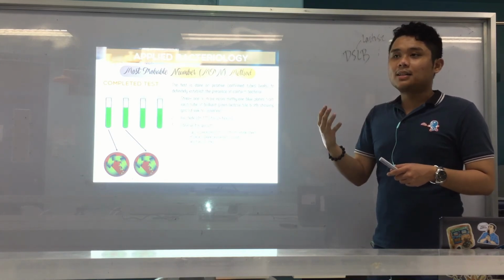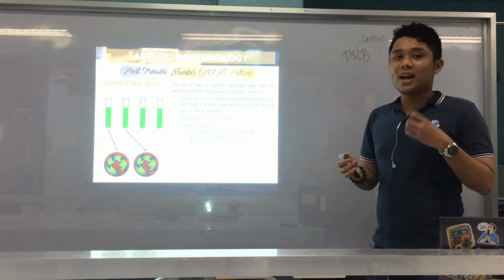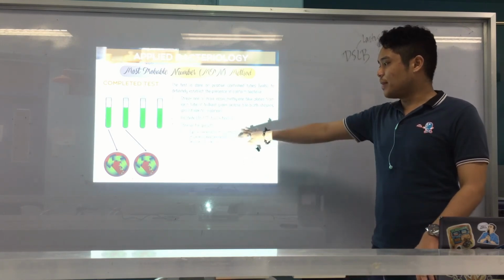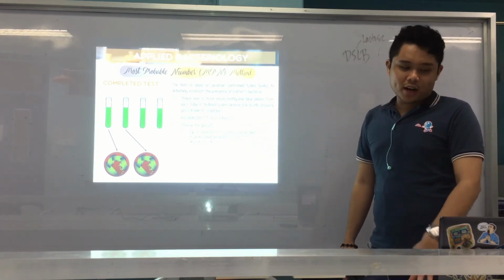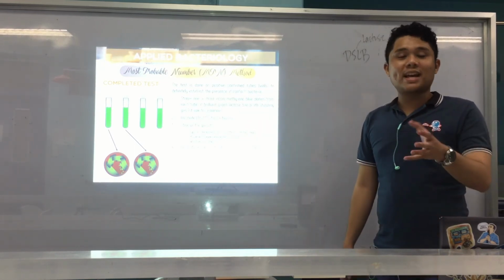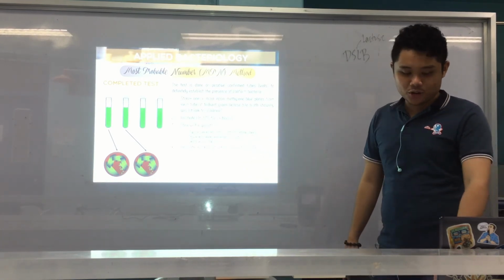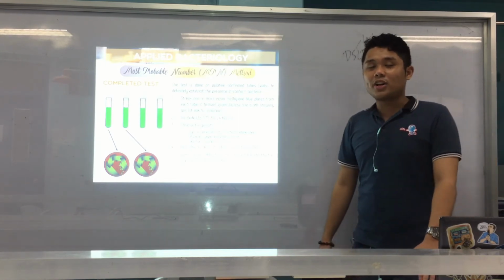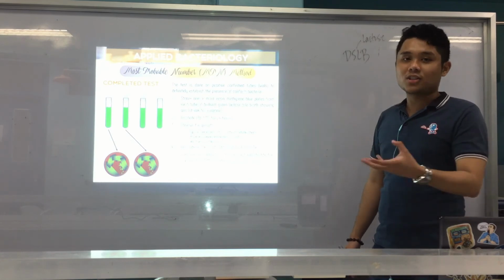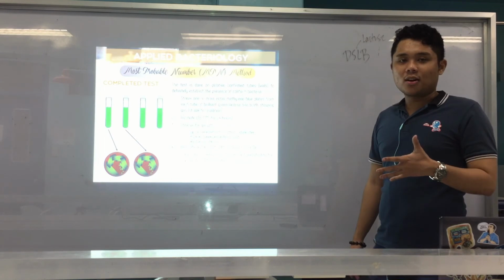Same as the colonies of your E. coli on EMB and also your Enterobacter. Enterobacter, fish eye colonies on your EMB. Okay? Alright, so typical, atypical, or negative if different colonial morphology. Okay, and from there, if there is growth on EMB, pick a colony, alright? And then inoculate on NA slant, nutrient agar, and then we gram stain the colony from the nutrient agar and perform IMVIC to determine which coliform it is. Okay, but again, it's not routinely done unless it is requested, alright?